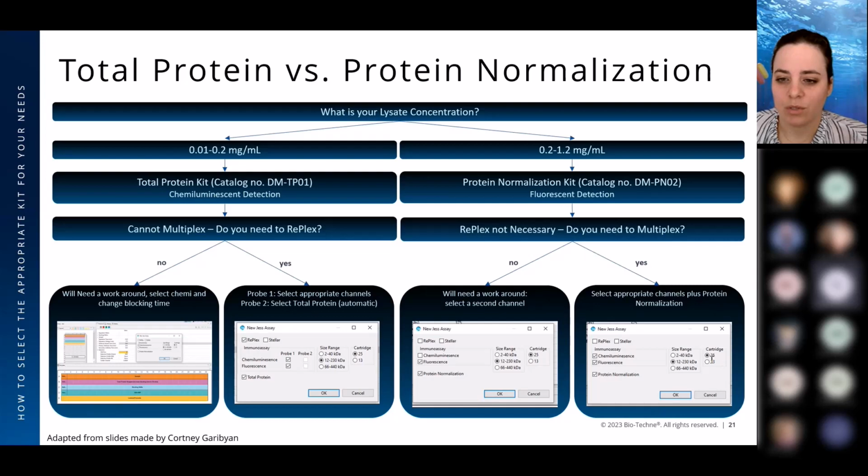So what we normally do is that we reconstitute that reagent, the original one, right? For the stock solution, we put it on ice briefly, and then prepare the working solution. And then as we're ready to put it on the plate, we put it on ice too. But just conceptually thinking, it's room temperature versus -70, whatever that powder is in the original reagent. What would be the official recommendation? How do you do it in your labs?